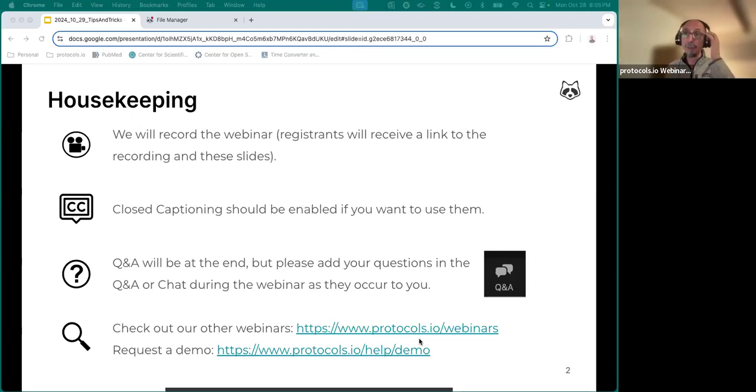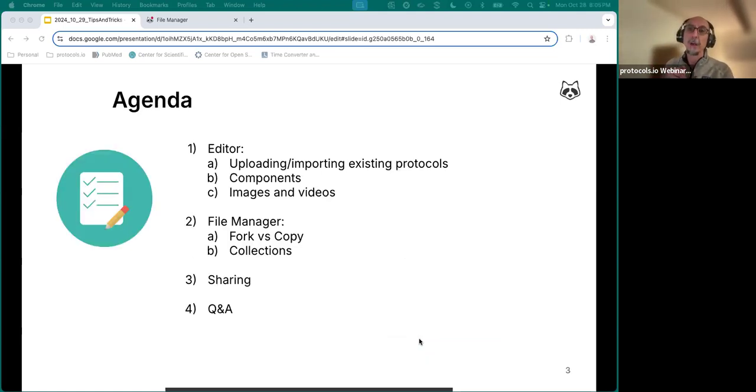This presentation will be mostly a live demo, so I don't really have slides for it, but here is what we will be covering. I'm going to be offering you some tips and tricks to help you improve your protocols. These are functionalities that it might take you a couple of months to figure out on your own, so that's why I will present those tips and tricks for you now.